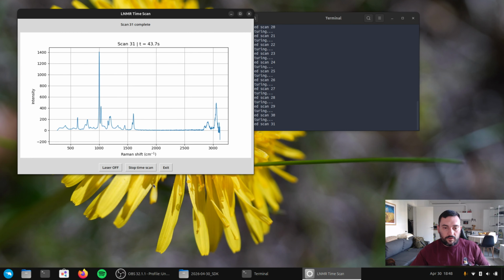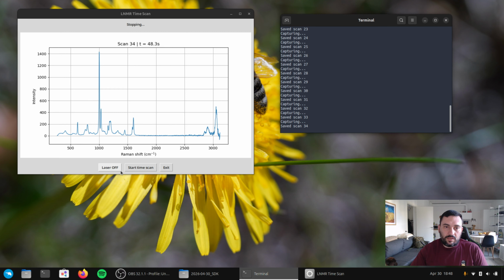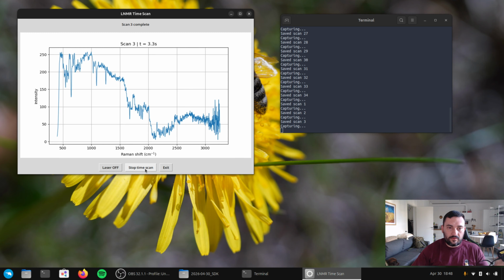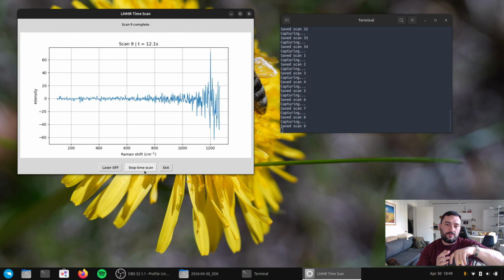Let's wait for a while, and then we can stop the time scan, and later we can record another one. Right now, for example, we can disconnect the polystyrene sample and start another time scan. For example, now sunlight, this is the sunlight, I turn it the other way, less sunlight, then block with my hand, almost 0.